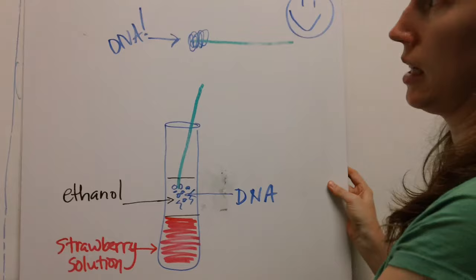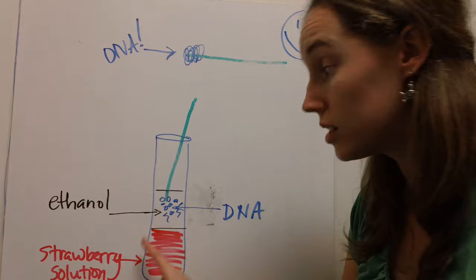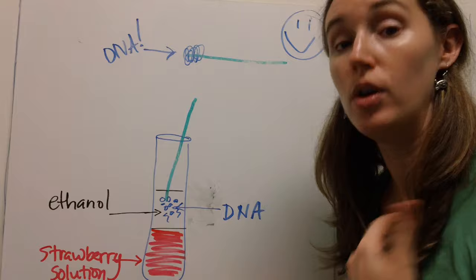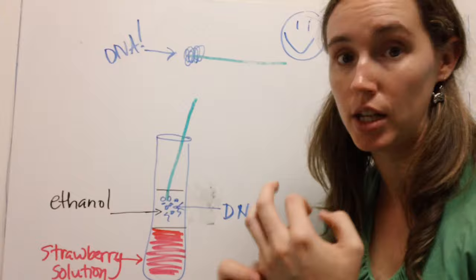So to put that in a diagram, just to remind us, we had our DNA that was dissolved in the soluble strawberry solution. Then we added the ethanol layer to it, and the DNA rose to the top because DNA is insoluble in ethanol. Then we used our stick and wound the long DNA strands around the stick and pulled it out, and it was covered in DNA. Well done.